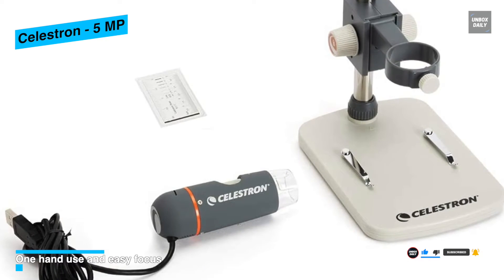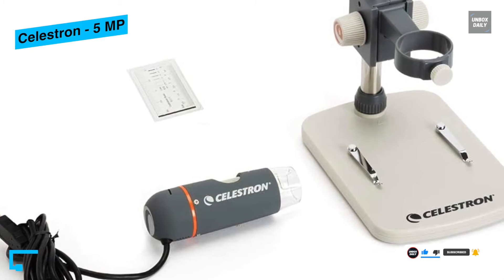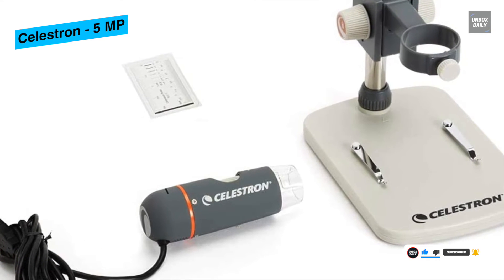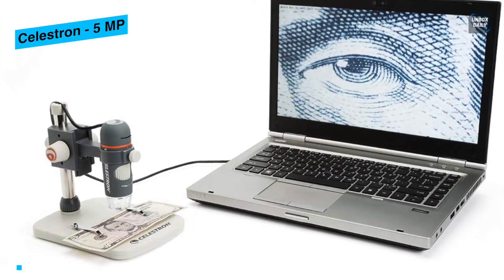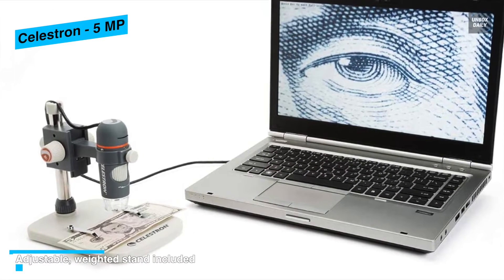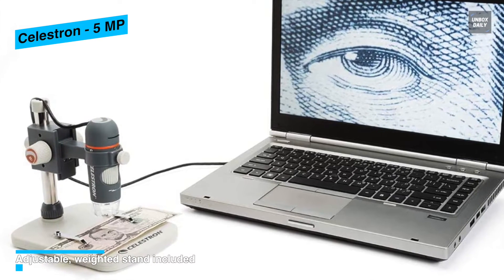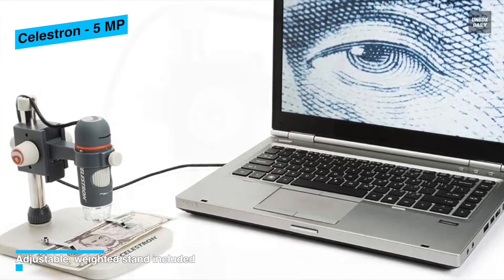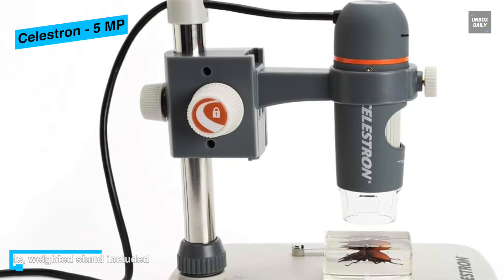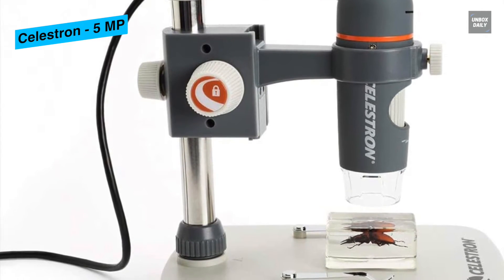The microscope also comes with a 5-element IR-cut quality glass lens with 20x to 200x magnification, ideal for low-power viewing of 3D specimens. With its precision 5-element infrared-reduction glass LED and true 5-megapixel imaging sensor, the Celestron Pro microscope ensures sharp focus on the specimen for clear images on the PC.